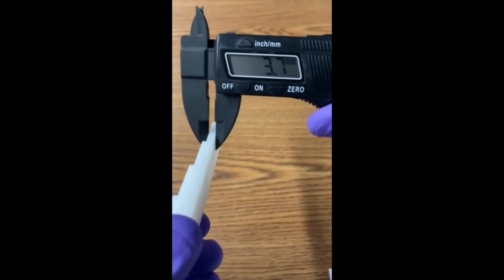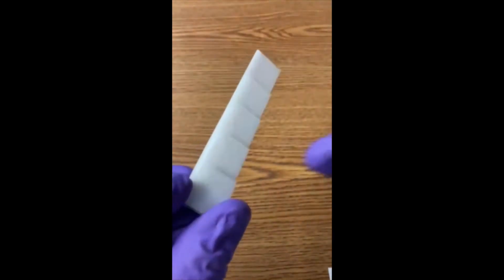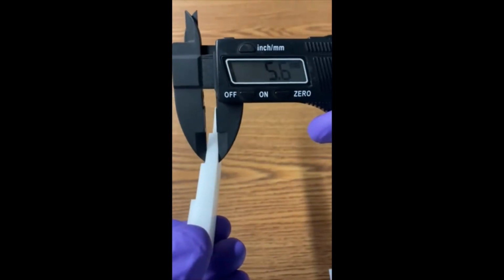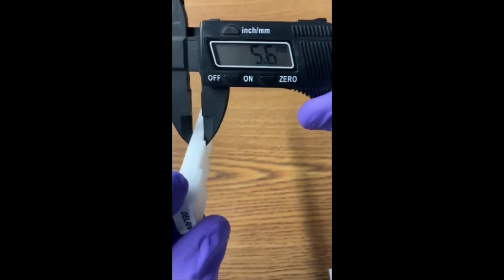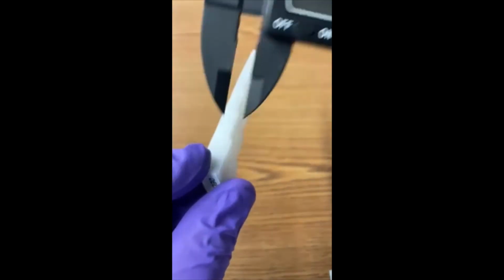The ultrasonic pulse will continue to reflect back and forth in the sample, so there will be multiple pulses picked up by the transducer. But they will be of decreasing intensity due to the attenuation of the wave amplitude associated with energy loss vibrating the atoms as the wave propagates.